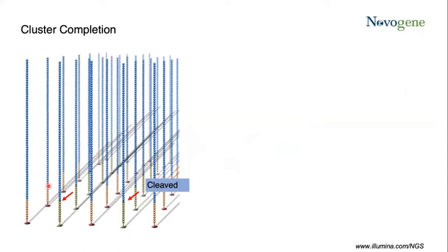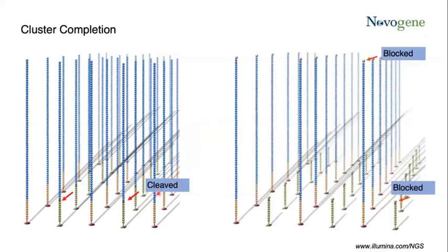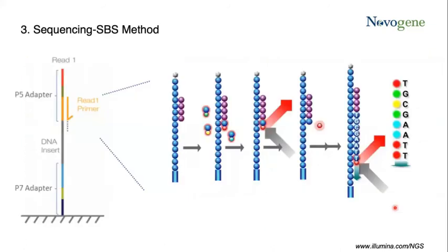After the amplification of the reverse strand, these reverse strands are cleaved off and washed off, leaving only the forward strand, as the graph shows. The 3' ends of the forward strands are blocked. This blocking is to prevent unwanted binding again between the 3' ends and the cleaved oligos. So now the clustering has been completed, and the fragment structure is able to be sequenced.